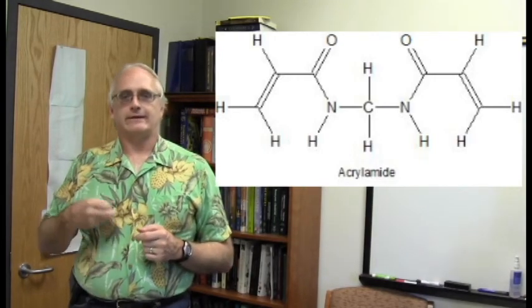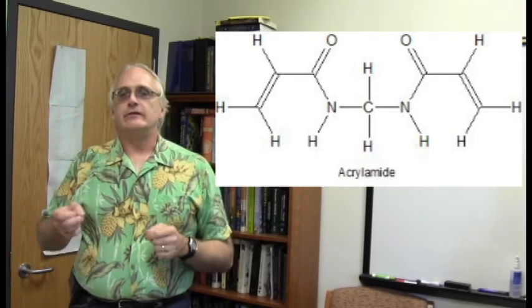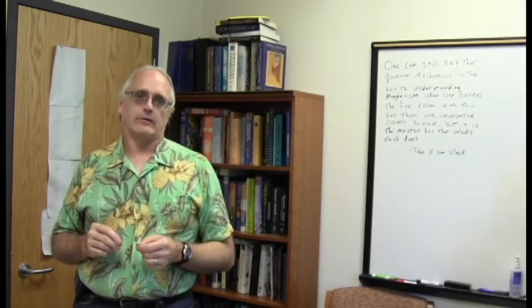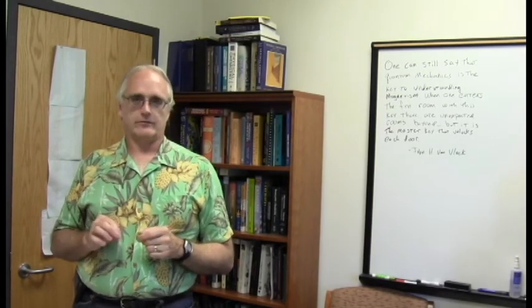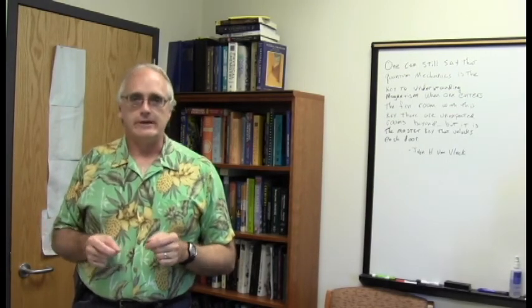And then how we can get further information and confirm what we understand about our molecule from these 2-dimensional NMR spectra. We'll do a couple other examples of using these spectra, and the unknown for this module, you guessed it, is going to have all the different kinds of spectra, including the 2Ds.